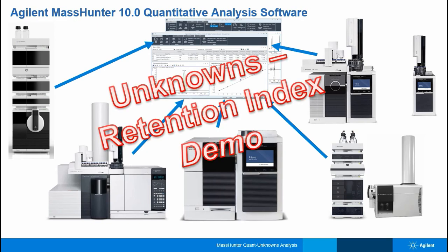Welcome to MassHunter Quant 10 Unknowns Retention Index Demo.